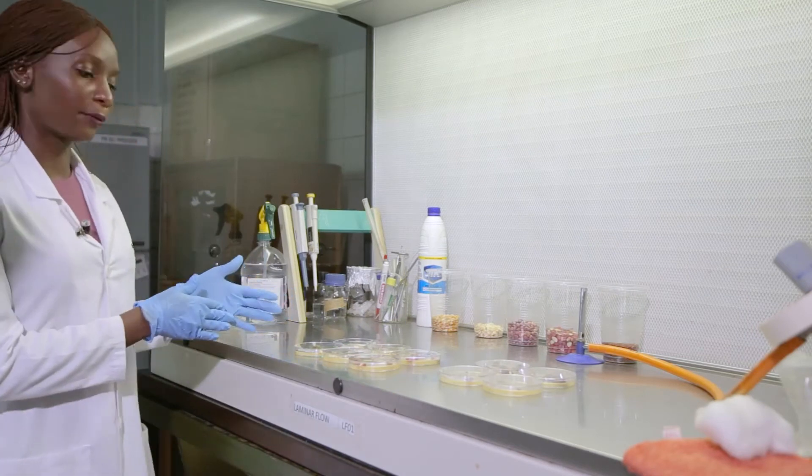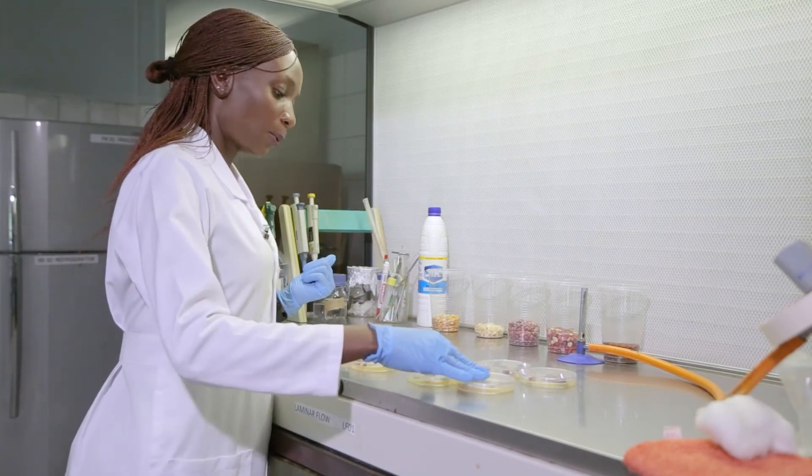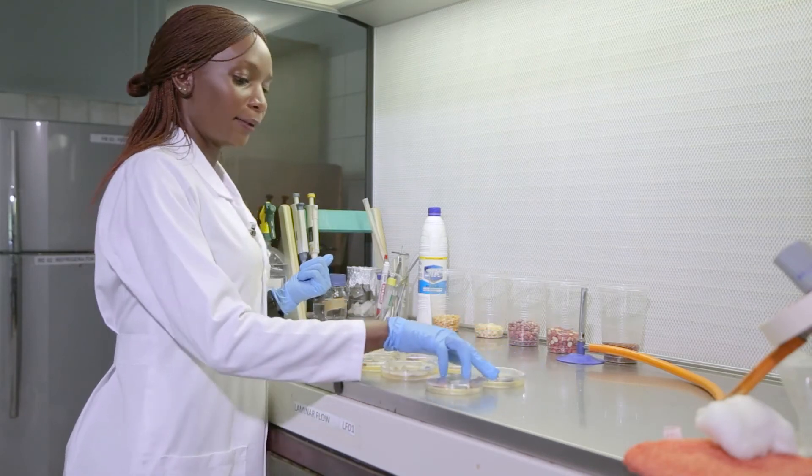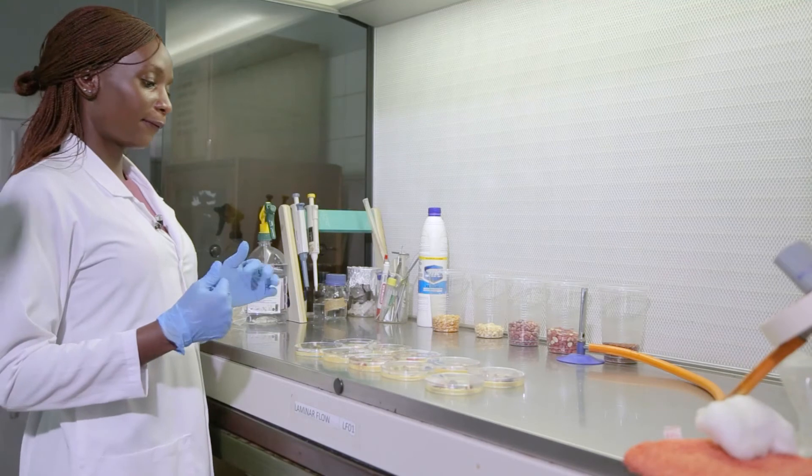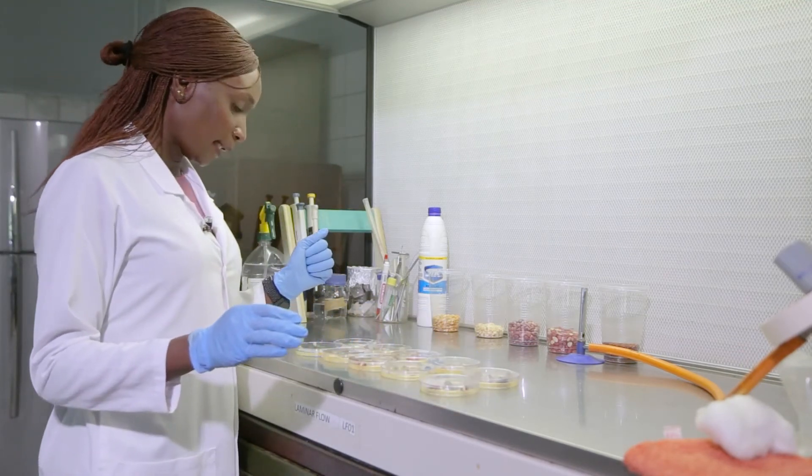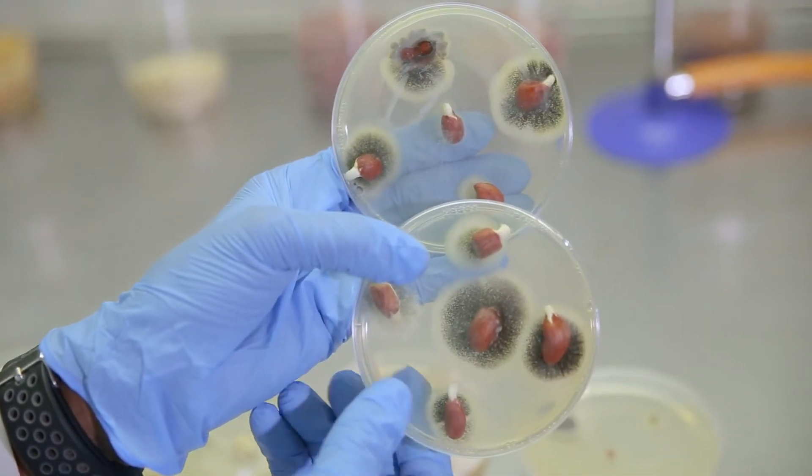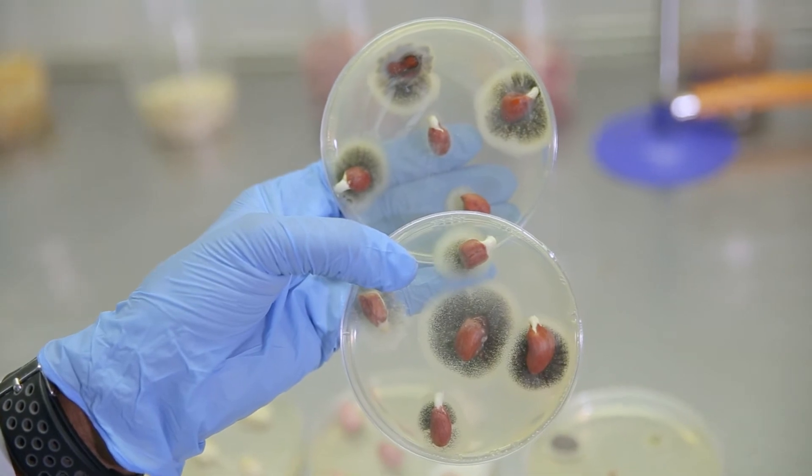You do the same for the rest of the plates or the grains that we have. What I also want to quickly point out here are the variety or diversity of molds that have manifested themselves on our plates. Dominant, I'm seeing this black mold, which is most likely Aspergillus niger. This is the black mold that we are seeing here.